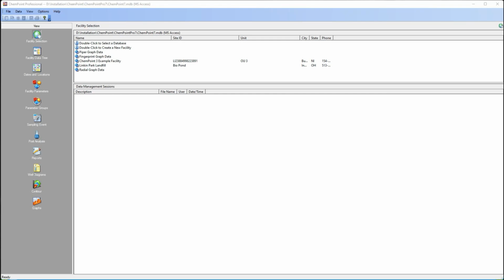In this video, we're going to look at how to copy a ChemPoint Professional database from Microsoft Access to Microsoft SQL Server. Here I have my ChemPoint database open in Microsoft Access. I'm going to use the ChemPoint 7 sample that comes with the program.